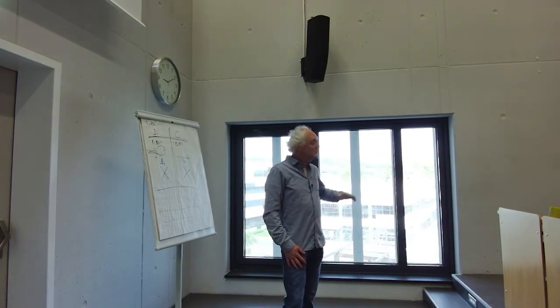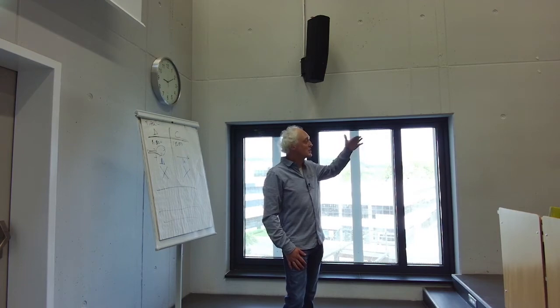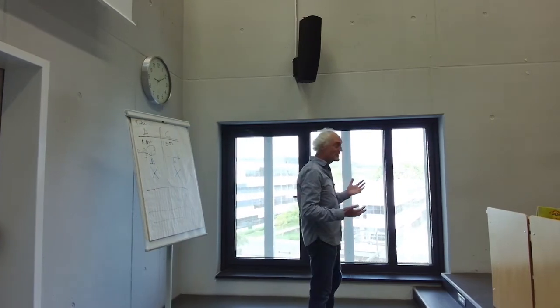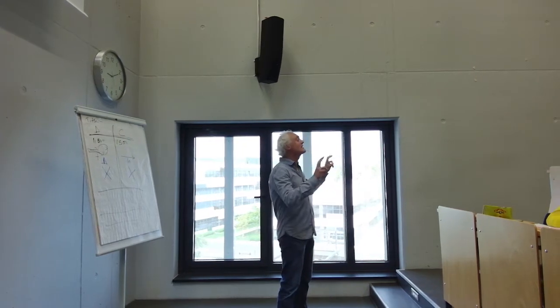This feed rate, we talk about constant feed rates here. So we don't want to change the feed rate, we want to keep the feed rate constant. And of course, if we would use an exponential trajectory and so on, this is not the approach. So we talk of a setting where we use a constant feed rate, and we just want to bring in a high concentration of our substrate, and we want to optimize, for example, ethanol production. So it would always be the case that V is V average and dS/dt is 0 for this constant setting.